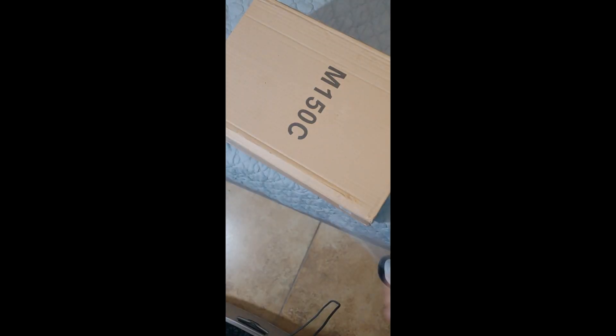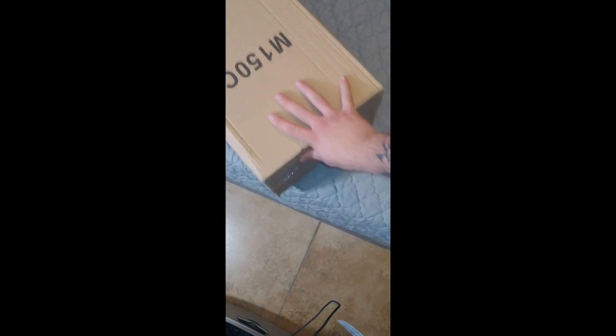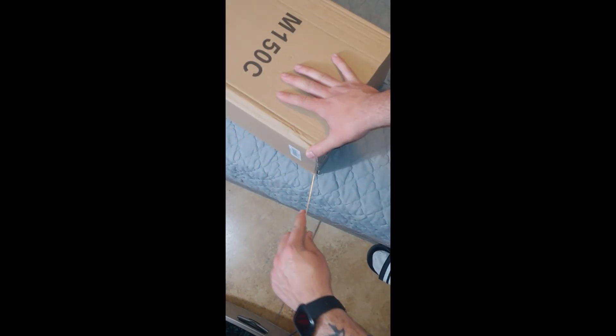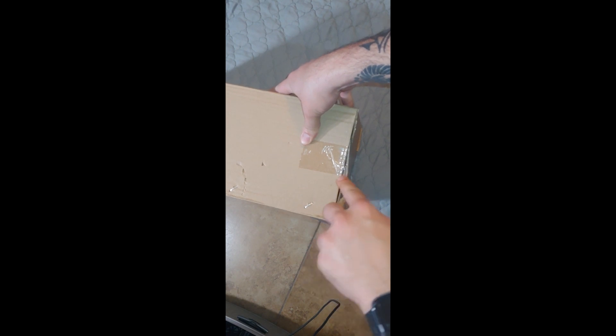I forgot a knife but I got myself a little knife here, so let's go ahead and get this packaging open. I kind of improvised here with the angle so hopefully we can see well. Again, I got it on Amazon — it was like 75 bucks.